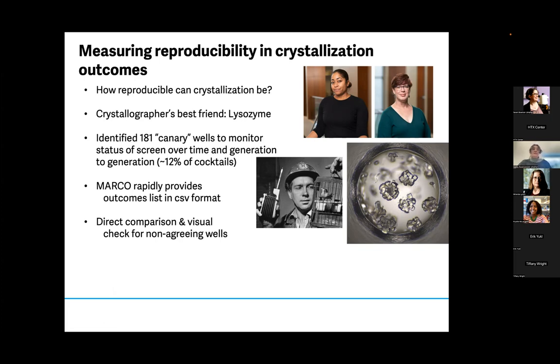One thing that I experience often with Marco is that it will see the shadow from the edge of a drop and identify this as crystal, I think because it looks similar to the edge of a very sharp crystal.